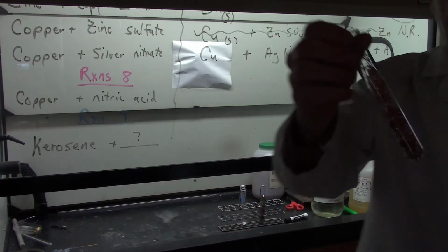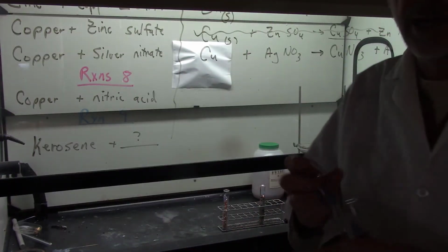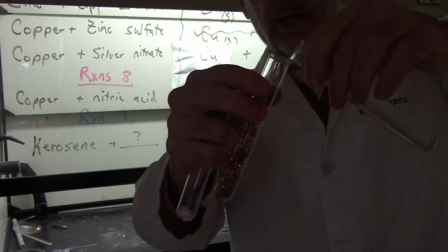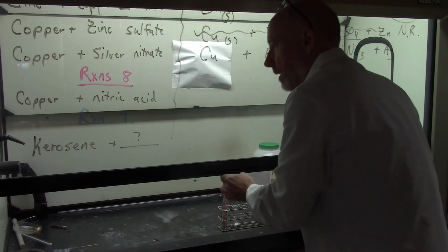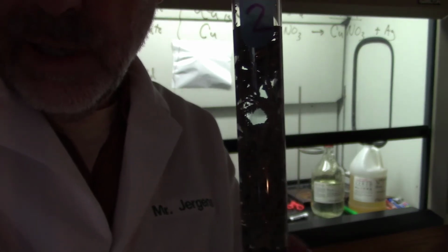You've got the plain copper turnings, Cu with a 0 charge. Silver nitrate, AgNO3, when we put it in water, it dissolves, so it's aqueous. Anything that has nitrate attached to it is always aqueous. Last night, I took the silver nitrate and I poured it into the copper, and let's see if anything happened. Something happened. Oh boy, I wish you could see this.